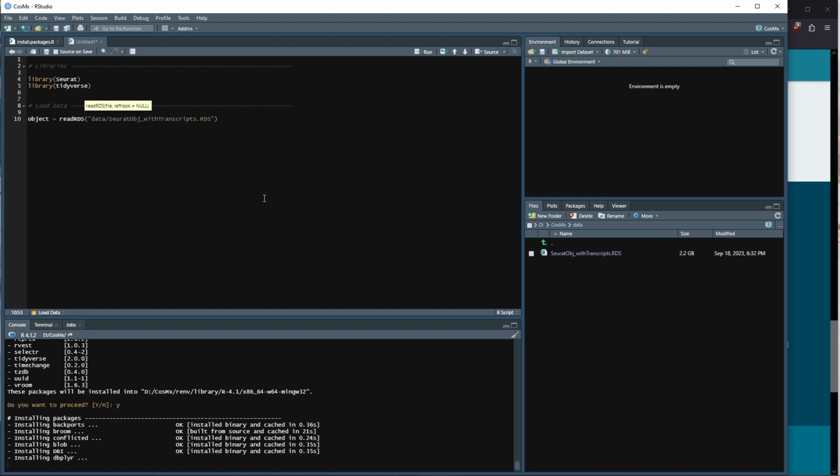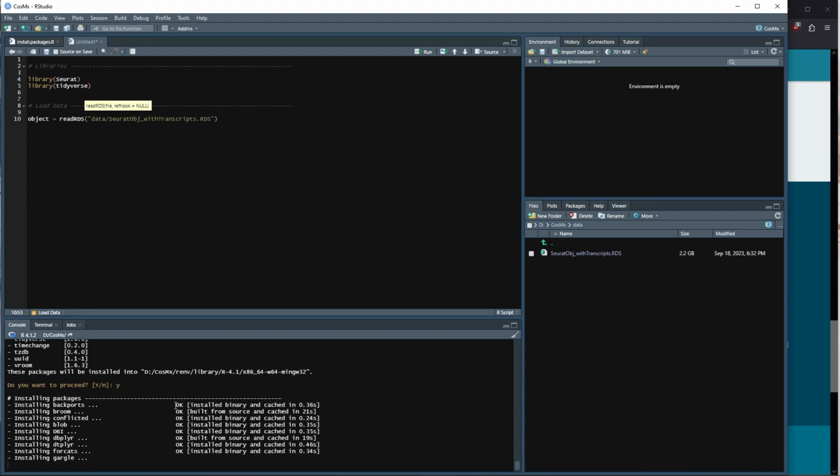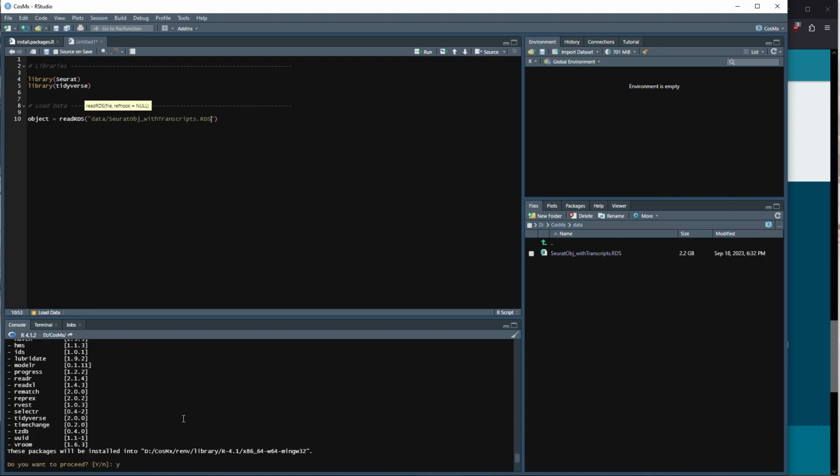and it should autofill. All right, it's taking a little longer than I would like down here to install all these. I should be getting pretty close. Yeah, there's not that many.